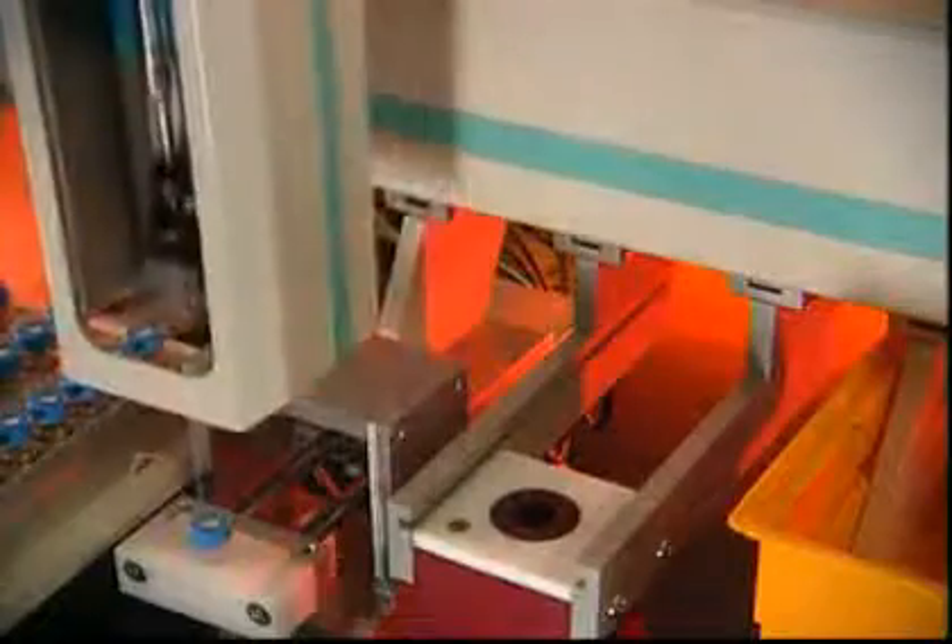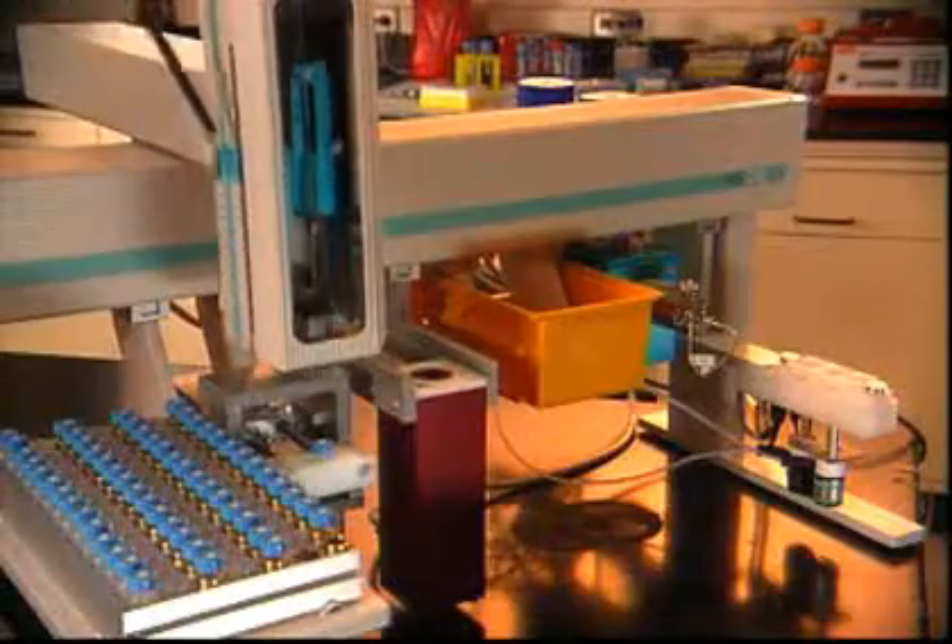Thousands of samples can be processed per day, reducing labor costs and improving workflow. Whatman Mini-UniPrep: the fastest and most convenient method for HPLC sample preparation.